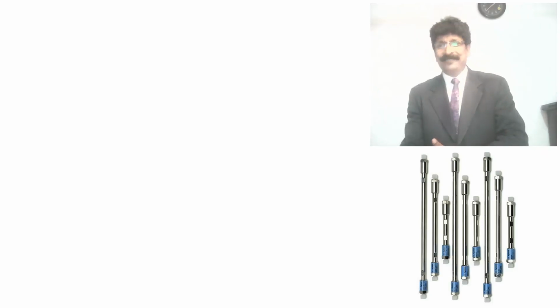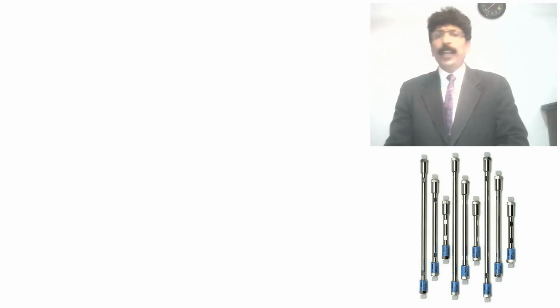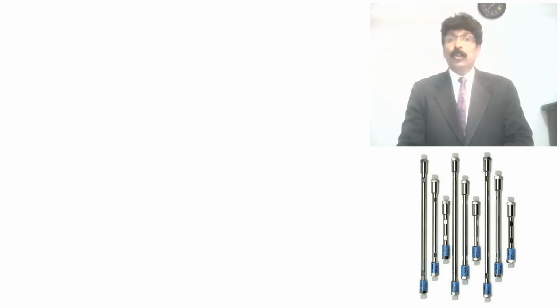So these are some pictures of the columns. You see, small. Previously it was told 1 meter. Now very short columns, ultra columns, are also available, with very minute particle size, so the surface area will be increased. Separation is very fast.